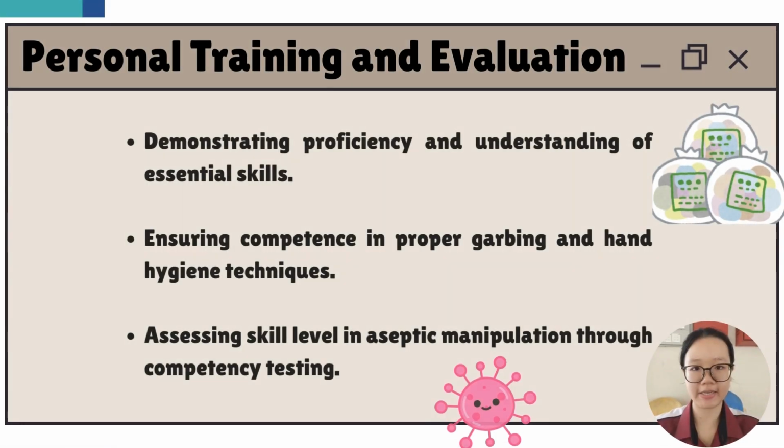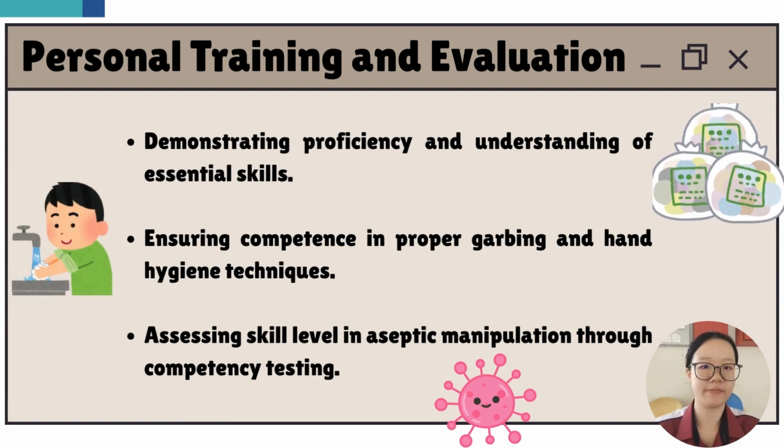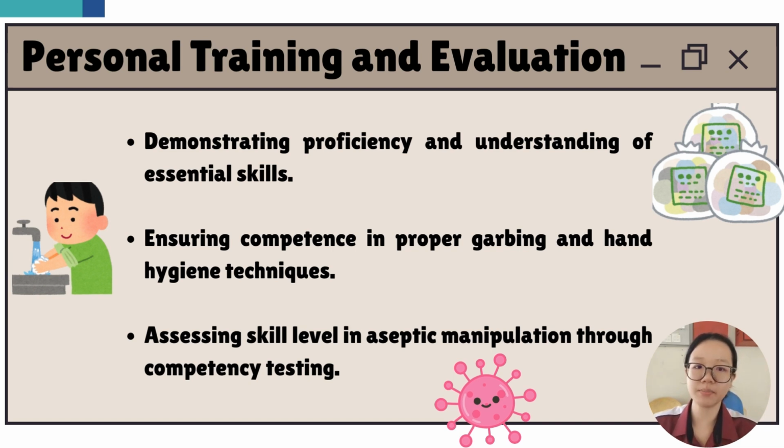This slide is about personnel training and evaluation. An essential part of maintaining sterile product quality is ensuring that all the personnel are properly trained and evaluated. This includes demonstrating proficiency in the core skills required for aseptic processing. Staff must be trained not only in the theory, but also in hands-on techniques.